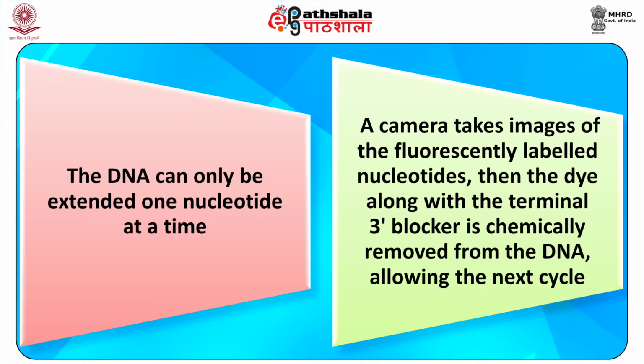The DNA can only be extended one nucleotide at a time. A camera takes images of the fluorescently labeled nucleotides, then the dye along with the terminal 3' blocker is chemically removed from the DNA, allowing the next cycle.